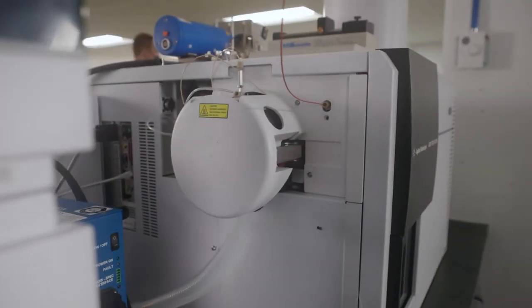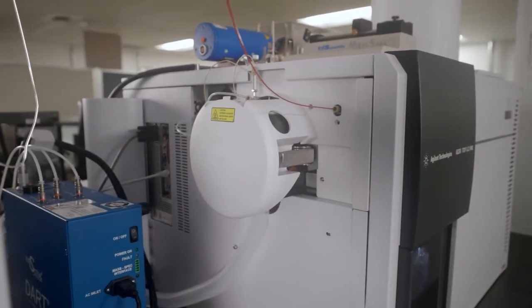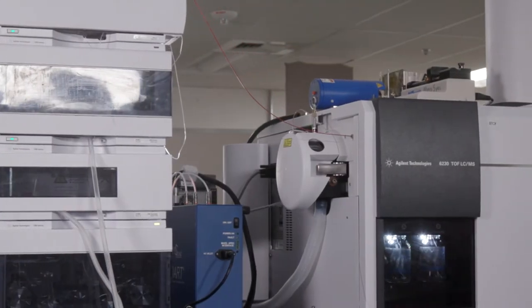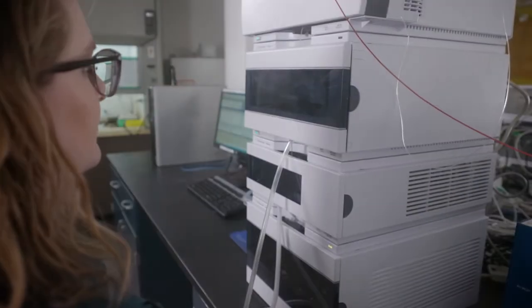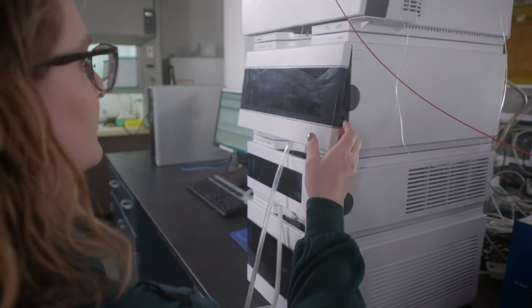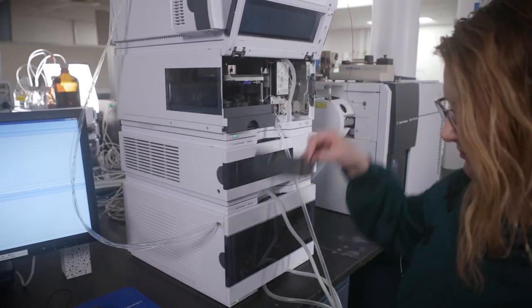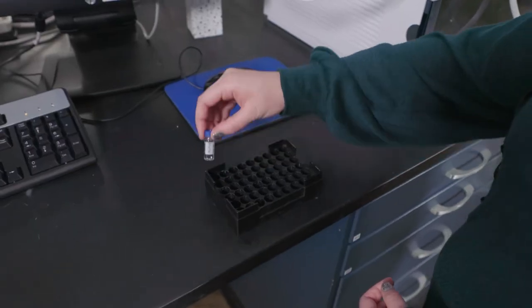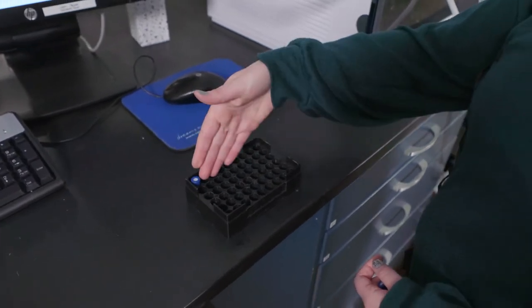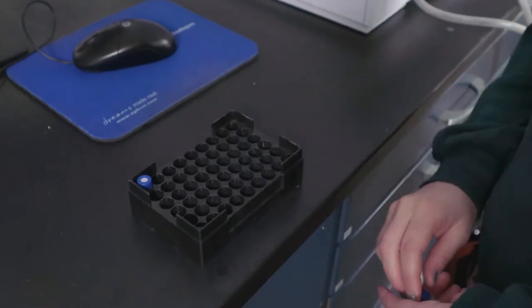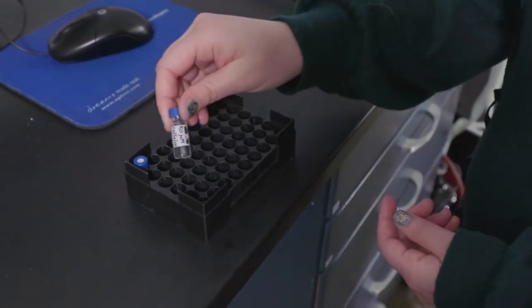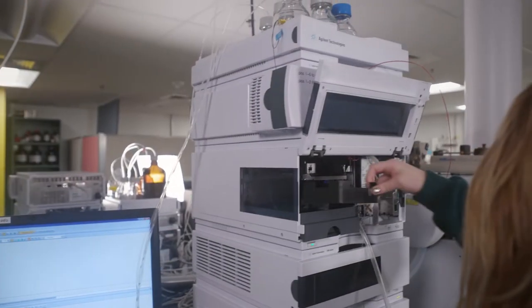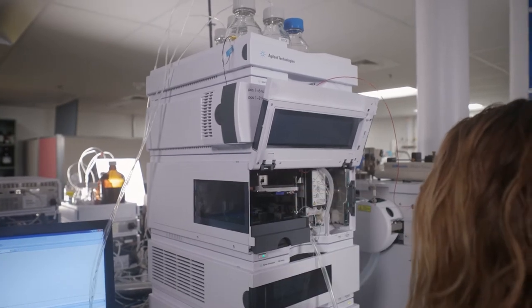Now that we are at the instrument, check to make sure the ESI source is installed on the TOF. If there is a different source, do not attempt to switch it yourself. Let's load our sample. First, press the button on the side of the autosampler and remove the front sample tray. There is usually a methanol blank in spot A1 and some other facility specific samples in the tray. Let's mount our sample in spot B1. Return the tray to the autosampler and close the door.